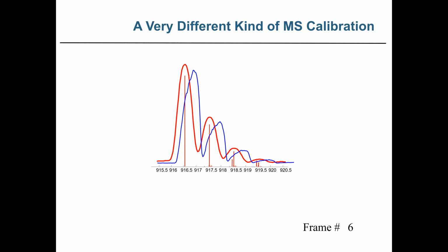And if you compare that to the measured spectrum, you see it's quite different. It's shifted in X, but it's also shifted in shape, and that's called the line shape. So the line shape of your measured mass spectrum, with these funny little wiggles here, is actually quite reproducible and consistent. The problem is I don't know what it is. It's not mathematically defined. So how do we compare theoretical mass spectra with measured mass spectra? Well, we can't do it very well.